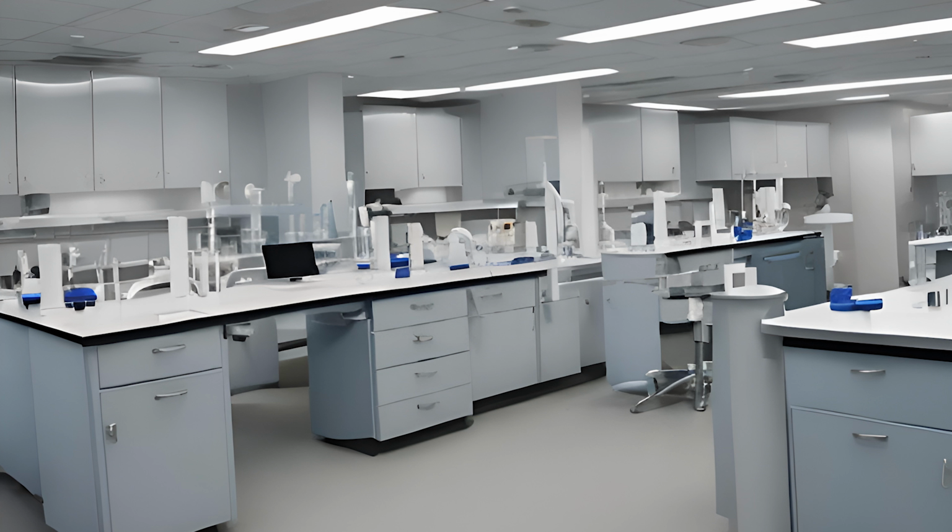The proper grounding of your electrical equipment, any ergonomics issues that you may have in the lab. This is of special note in areas that have a high amount of repetitive motion, such as a high throughput serology and immunology lab environment, or a manual molecular diagnostics lab, where a large amount of pipetting is done in a repetitive motion manner.